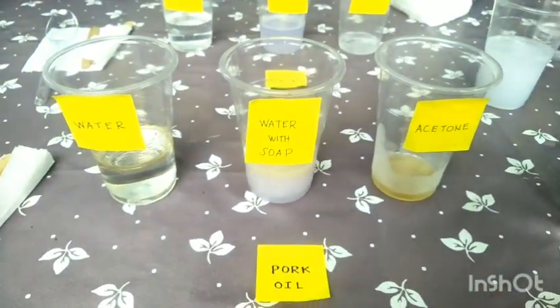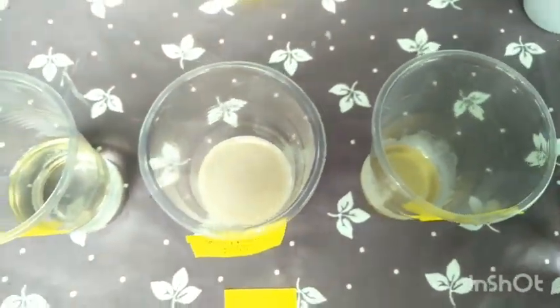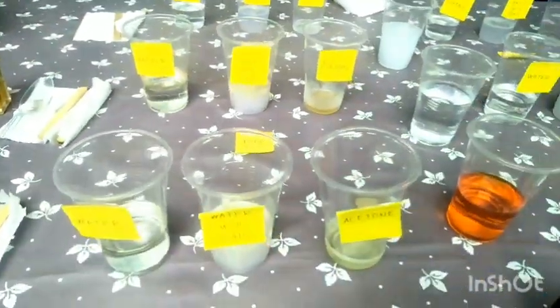The pork oil is the same as the coconut oil. It is also insoluble in both water and water with soap, while it is soluble in the acetone.